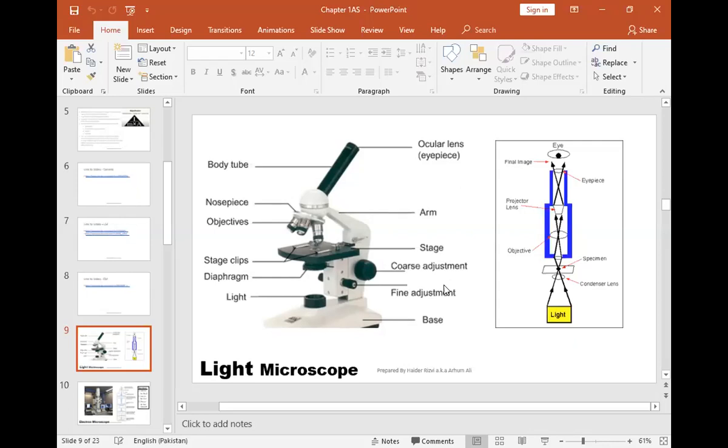If they are talking about light microscope, तो आप लोगों को पता होना चाहिए कि light microscope की ये चीज़ें क्या होती हैं. Basically these things will help you to gain marks in practical. So ये चीज़ें आपके practical की होती हैं. अगर आपको नहीं पता होगा कि how to move stage, how to move the fine adjustment, how कि उसकी base किधर है, उसकी stage पे हमने कैसे specimen रखना है, तो ये आपके marks deduct करेंगे. और उधर एग्जाम में आपके पास कोई ये चीज़ें बताएगा नहीं.